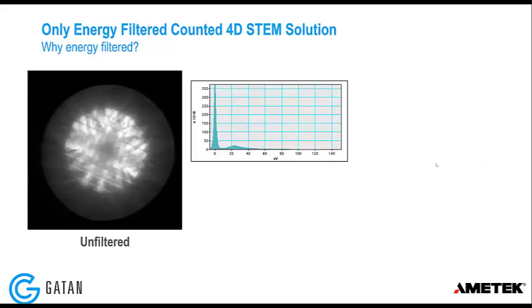Another thing, a couple of questions were whether the K3 camera that we are using here is installed on a Gatan Imaging Filter or not. So what you saw today was a pre-GIF camera, so it is not on a filter.